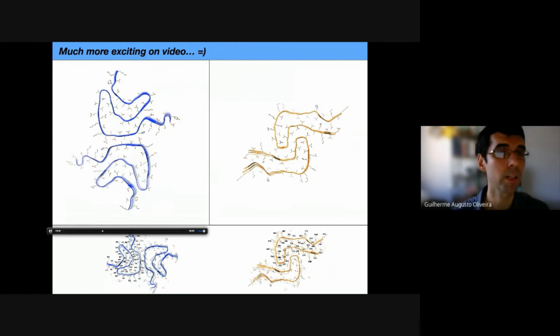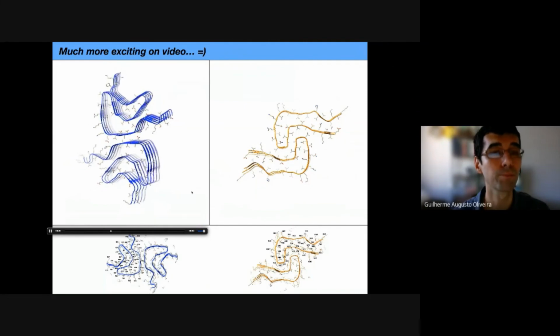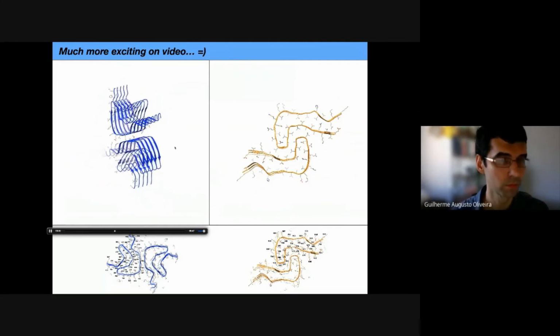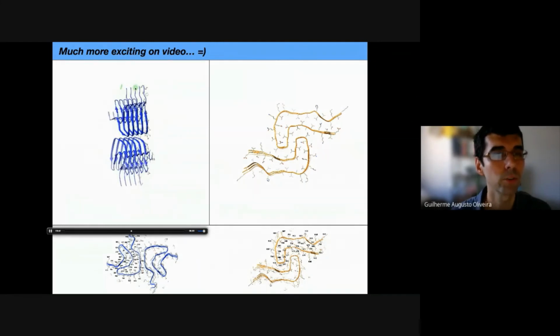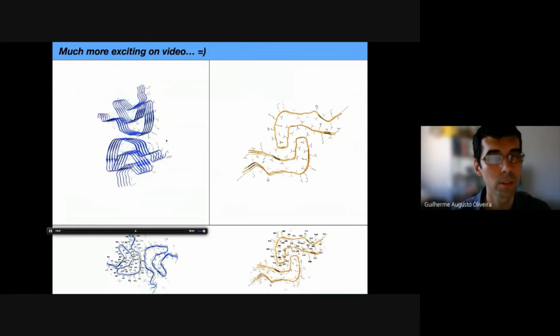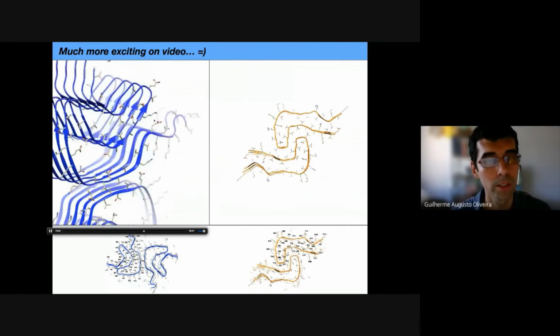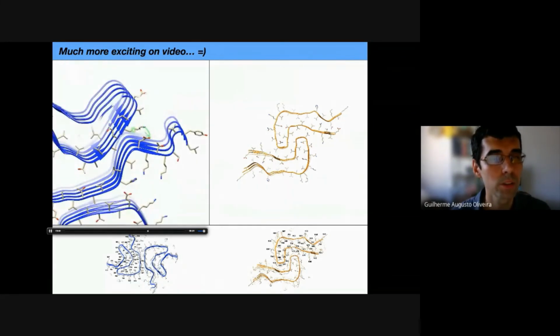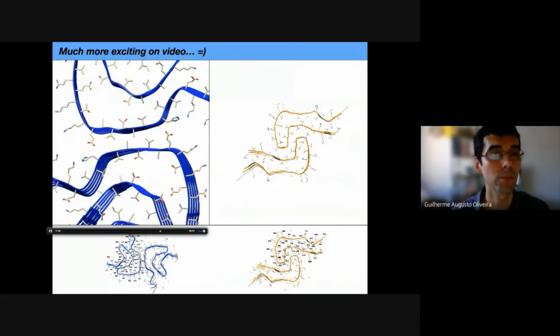First, on the left side of your screen, let's see some of the details I mentioned before. This is pretty cool because we can see each of the protomers. We have 5 protomers in here, and you can see some details. For example, there's an ion pair right in here. This is lysine 80, this is E46. It's forming an ion pair, a salt bridge, all over the axis of the fibril.